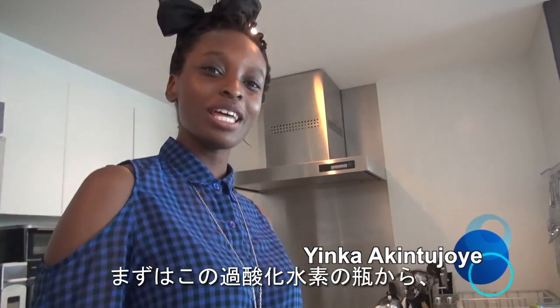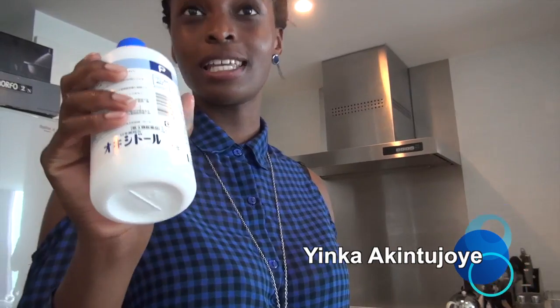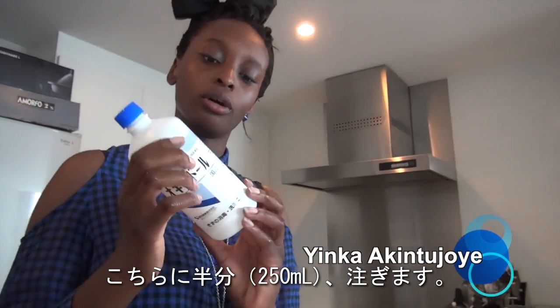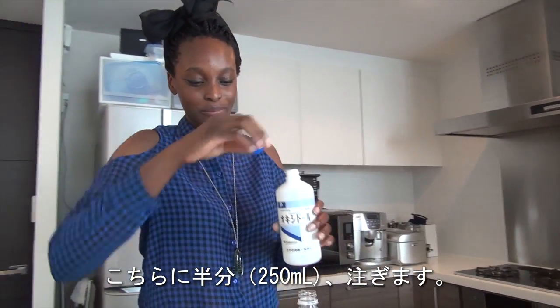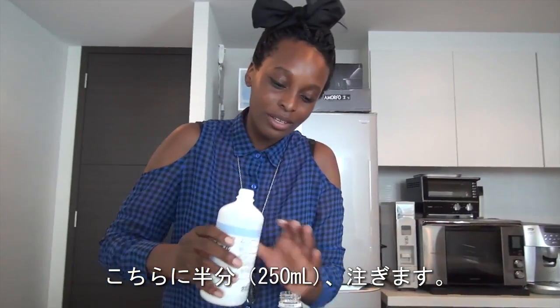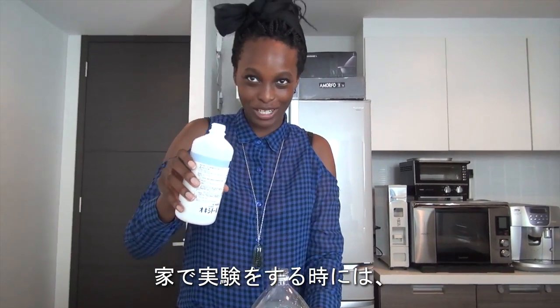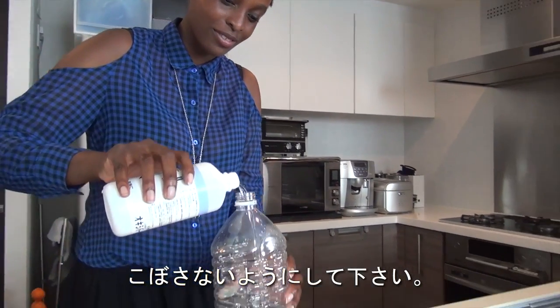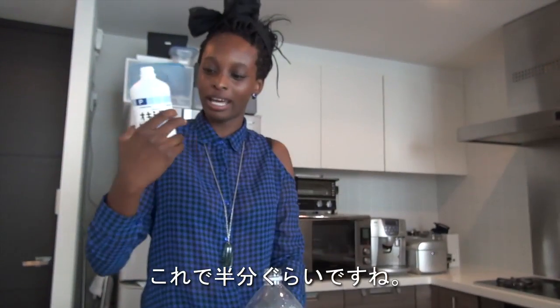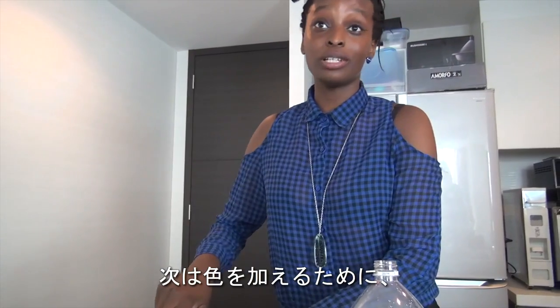Today we're going to do the elephant toothpaste experiment. The first thing we're going to do is take this bottle — this is hydrogen peroxide, H2O2 — and we're going to pour about half of this, which is about 250 milliliters, into this big bottle we have right here. Hydrogen peroxide is kind of caustic, so if you do this at home make sure that you don't spill any on yourself. That's about half, so that is good.